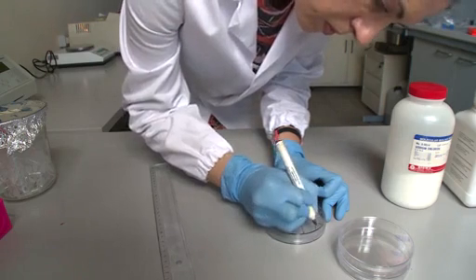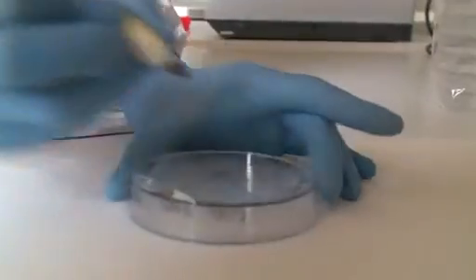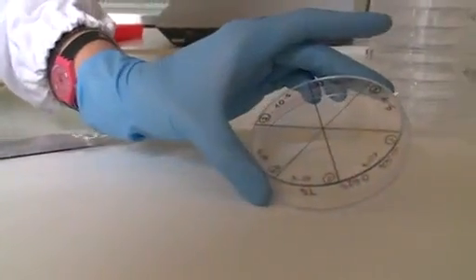Create six sections on the bottom of the petri dishes and label with replicate number and dilution factor.